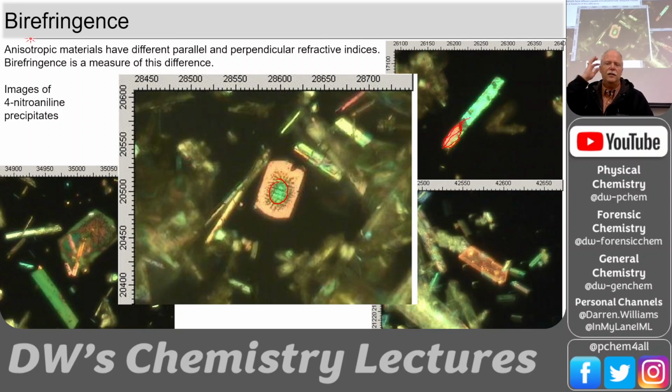You can't really tell from the color which one's lower and which one's higher, because the light will turn around and say green would come out, and then it would turn around more and red would come out. But if it keeps going around even higher, green will come out again, and then red will come out again. All the colors of the rainbow will come out, but they'll come out in order. So it depends on if one is slightly below, it might be red and green. But if this one is far enough up, it might be red and this might be green. So you really can't tell the depth perception. You can just say they're different depths.